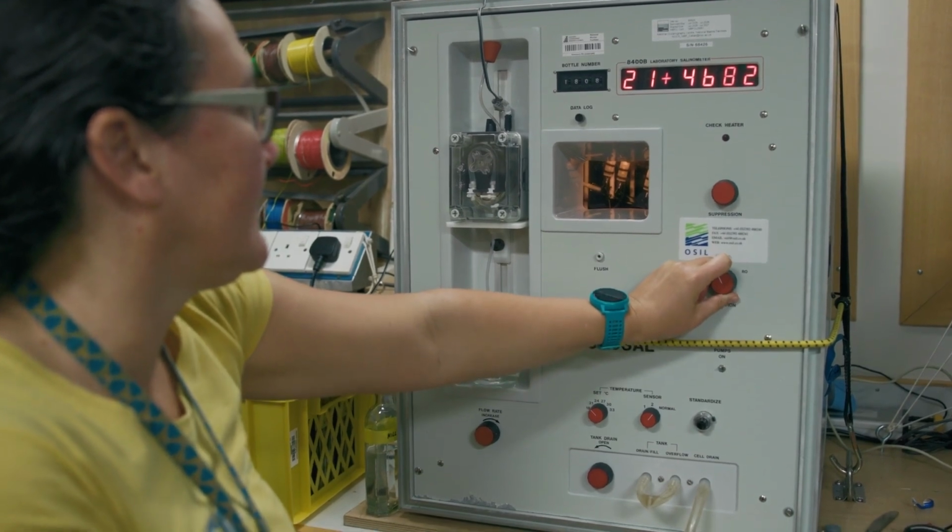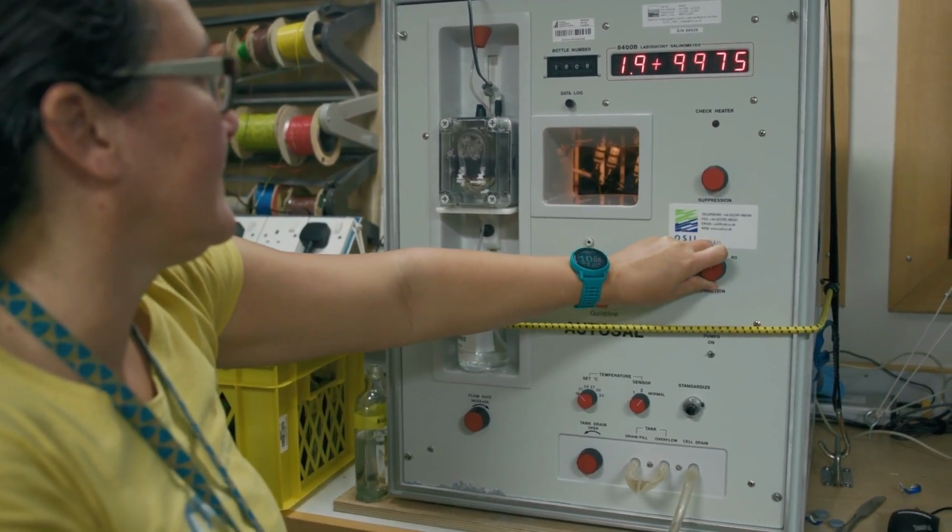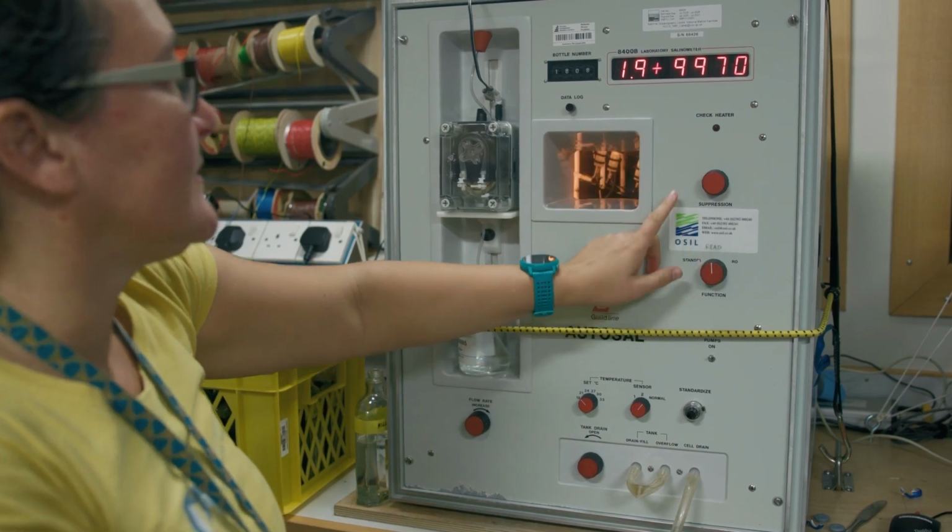Switch to read, and you can see how it initially starts higher, but then stabilizes about 1.99970.